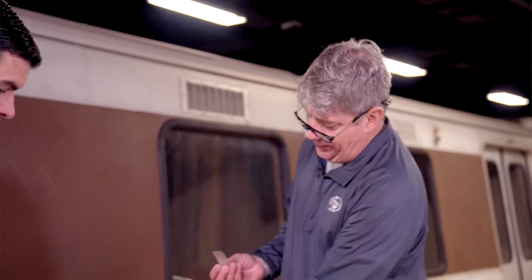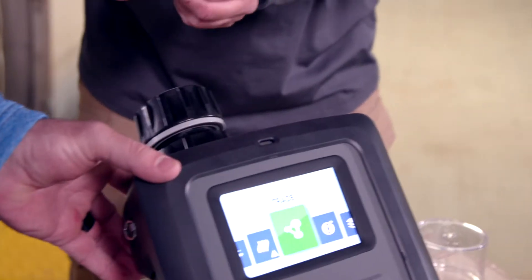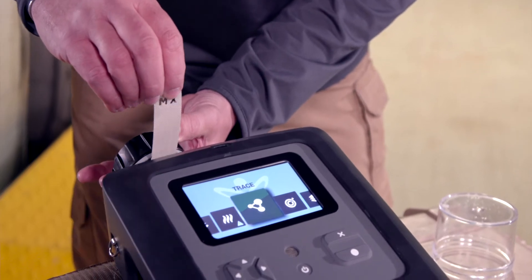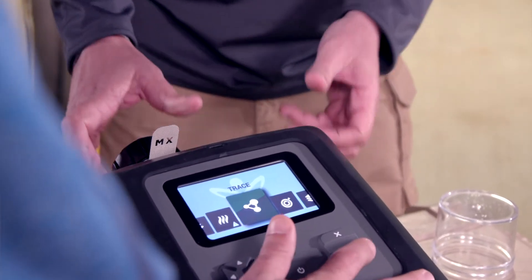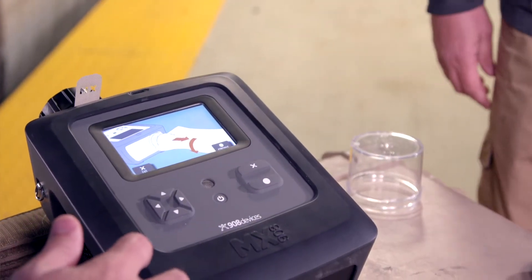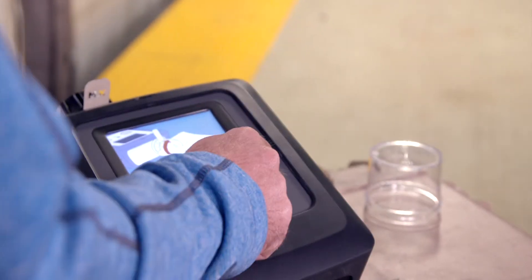We're going to open our trace sampling adapter here, insert the swab, close the adapter, hit trace, and run. We've inserted the swab. The device gives you all these hints telling you what to do.